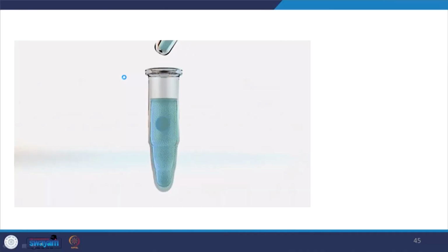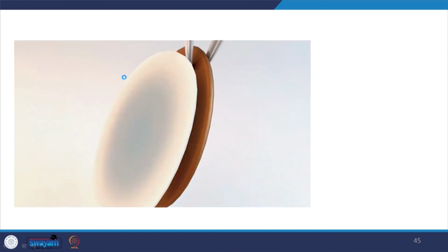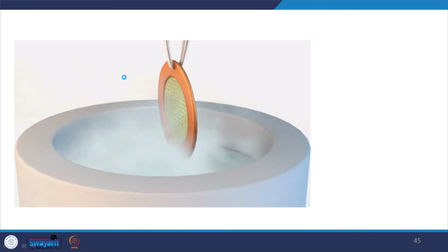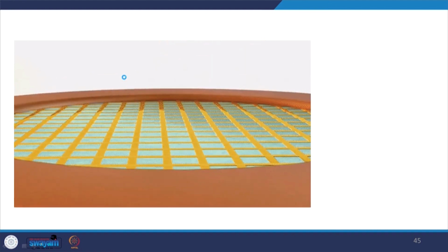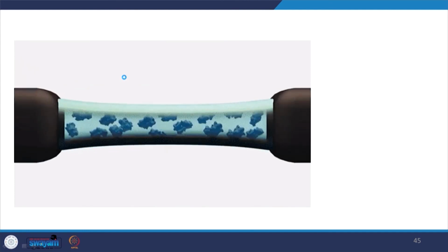So, we have covered the basic functionalities and the process involved. If you see here, you have a protein sample which contains the macromolecules. This is the grid, it is blotted as I talked about, then the grid is plunge frozen, and now it is time for data collection.